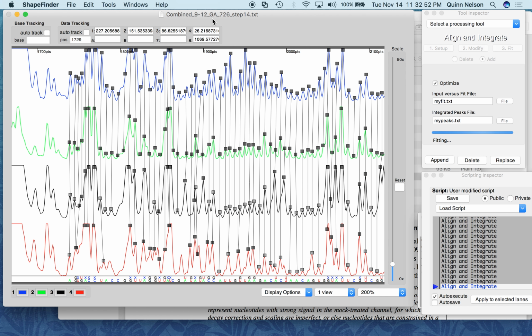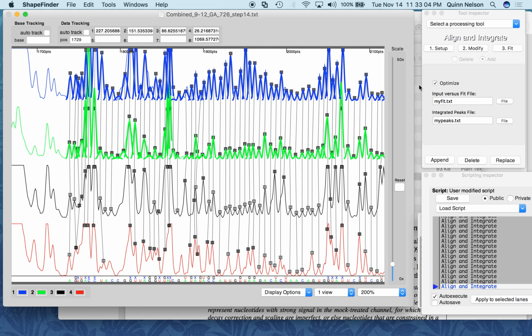Also, knowing where you are in the primer, in the molecule. We're using a 726 primer, so we should not get any data that's at the beginning of the molecule in alignment. We take care of that in the setup phase by making a sequence range.